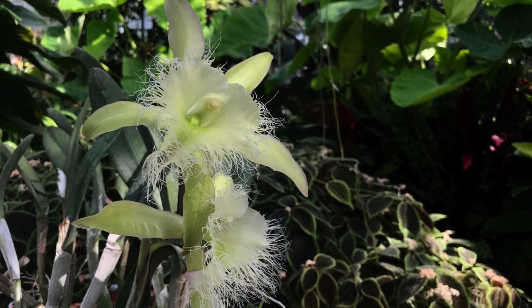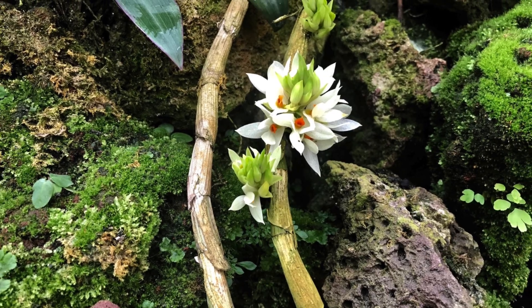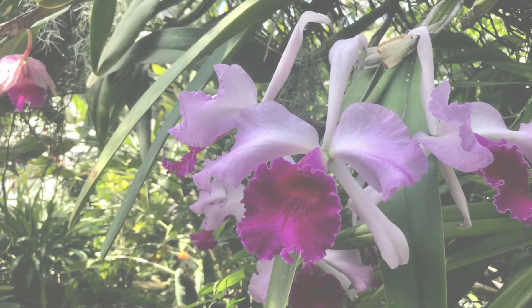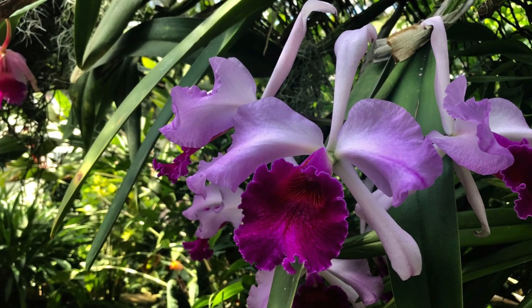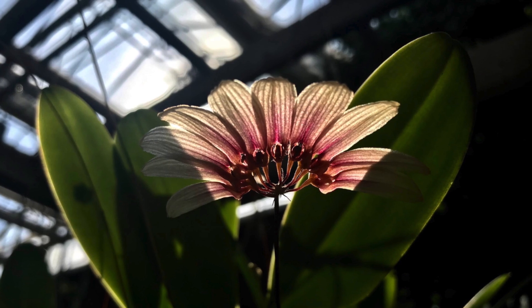Did you know almost all orchids you find in stores start off in tissue culture? The reason why is because in nature orchids rely on mycorrhiza, which is a fungus that facilitates the absorption of nutrients to the plants. However, those conditions are hard to replicate, which is why orchids are grown in tissue culture. So let's get started and grow our own seeds.